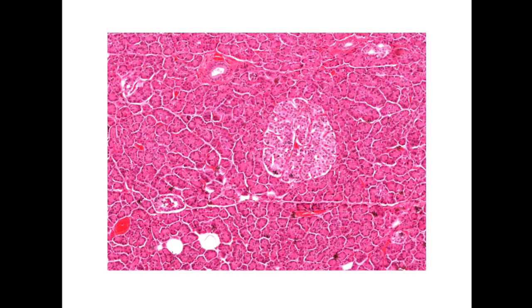Let's put it into practice. Here we have a micrograph — we're quite magnified so we can't see the connective tissue capsule, but we can see a duct present. Our first question: is this entirely serous or a mix? Based on its appearance, it's an entirely serous gland with no mucous acini present. Next question: are there islets of Langerhans present? Yes — this big round structure here is an islet of Langerhans, and therefore we're looking at a section of the pancreas. I hope you found this decision tree helpful in your identification.